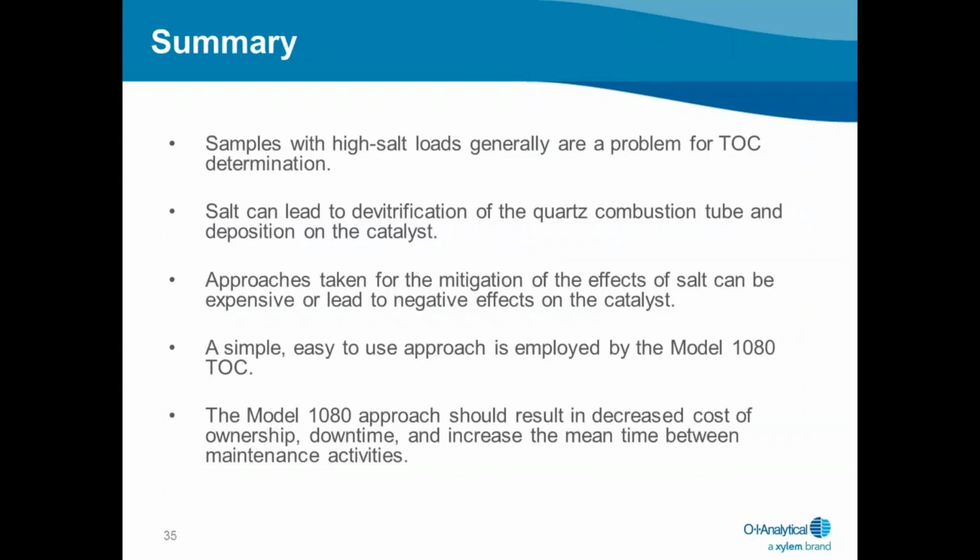In summary, samples with high salt loads generally are a problem for TOC determination. Salt can lead to devitrification of the quartz combustion tube and deposition of salt on the catalyst. Approaches taken for the mitigation of the effects of salt can be expensive or lead to negative effects on the catalyst.